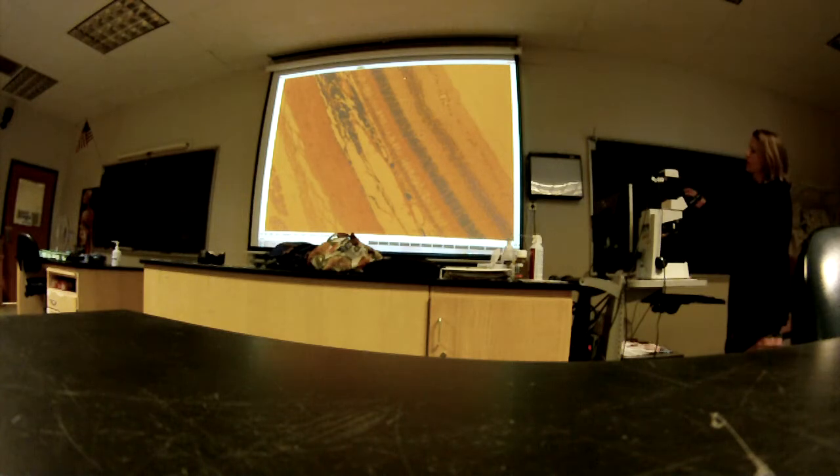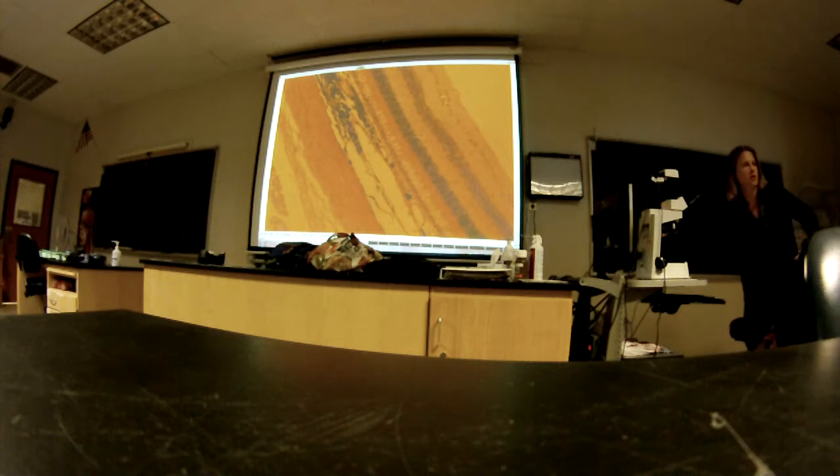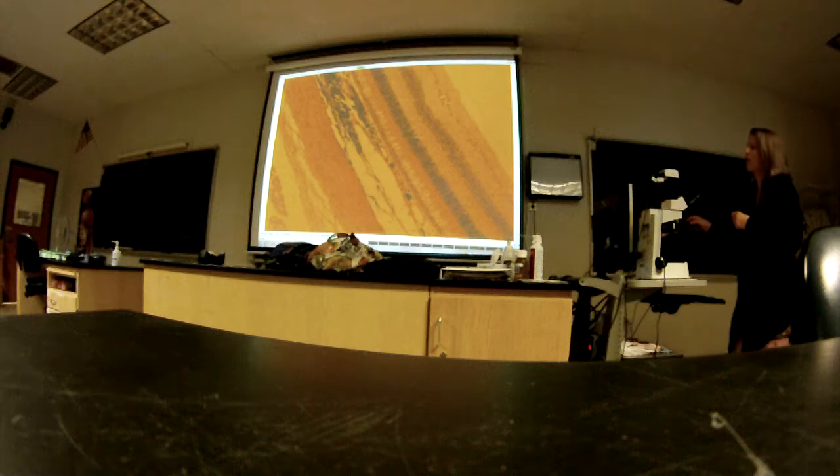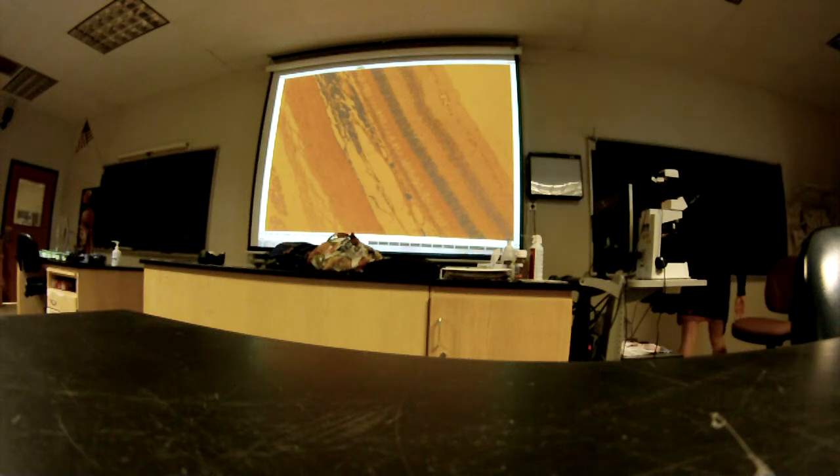So then let's identify the cells. So these are nuclei of what kind of cells? Glia? Is that the ganglion? You got three choices: bipolar, ganglion, or rods and cones. Rods and cones. Bipolar. Yeah. I thought the bipolar was... no, that's the glia cells.